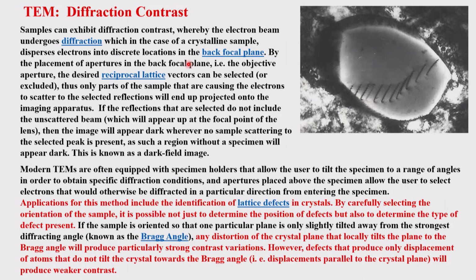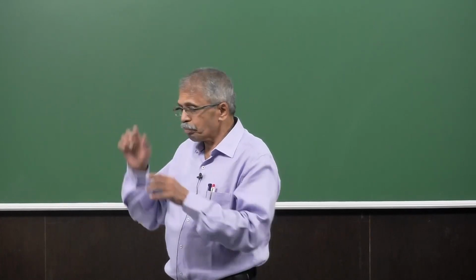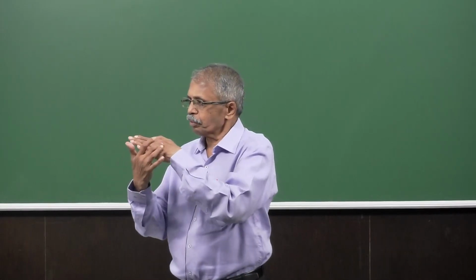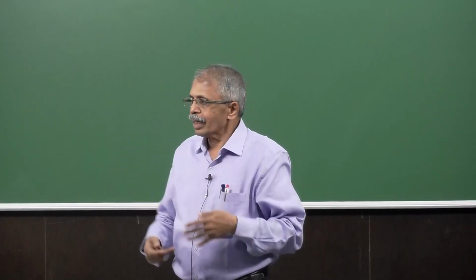microscopy or contrast diffraction. Using diffraction contrast microscopy, you can identify not only the lattice parameters and space group, you can also see whether that particular specimen, in that region, has everything perfect, all the layers are there, or any of the planes are missing, any of the atoms are defected. That is what you can identify from the diffraction contrast. This diffraction contrast is measured by orienting the sample with respect to the beam at different angles, because, you know, that nλ = 2d sin θ.